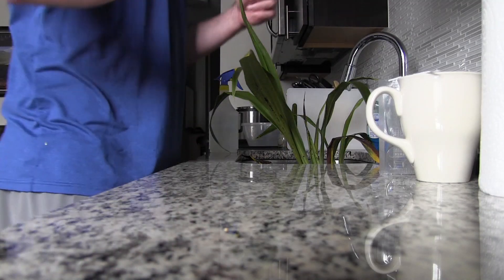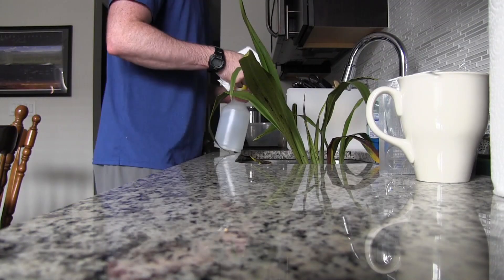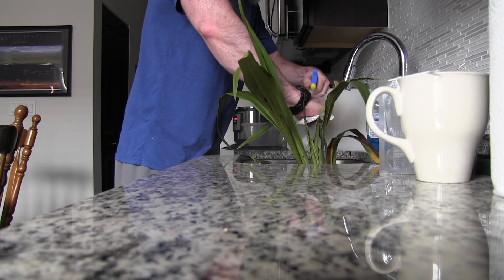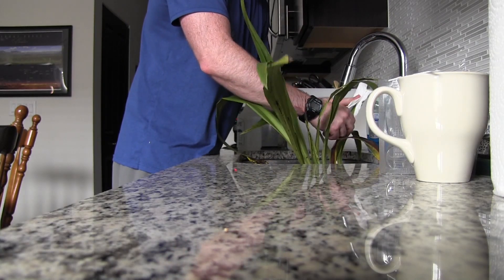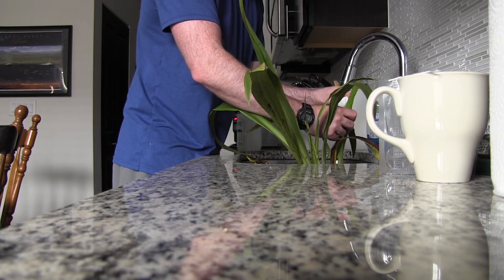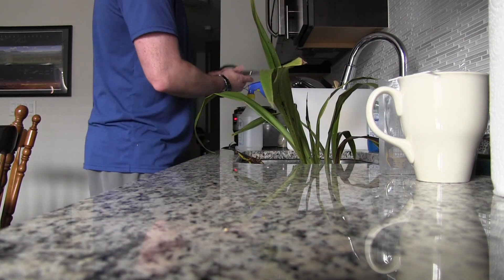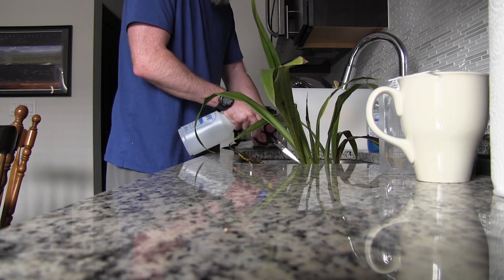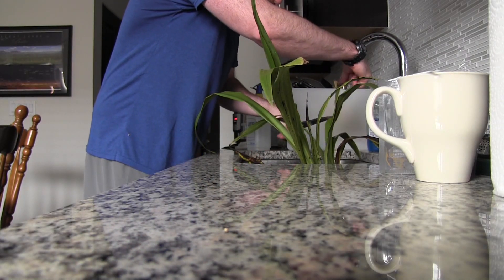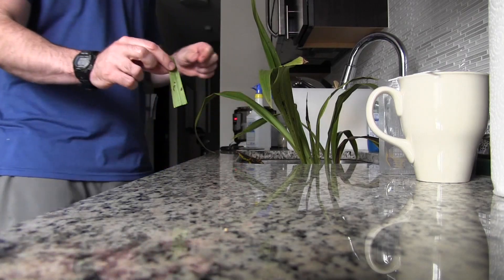I'm going to clean the leaf off that I'm going to take with some Physan, just to make sure that there's not anything on the outside of the leaf that could affect the test results. Then I'm going to spray my cutting tool with some Physan as well. I'm going to cut off the tip because it's kind of black, and then I've got a nice sized piece.